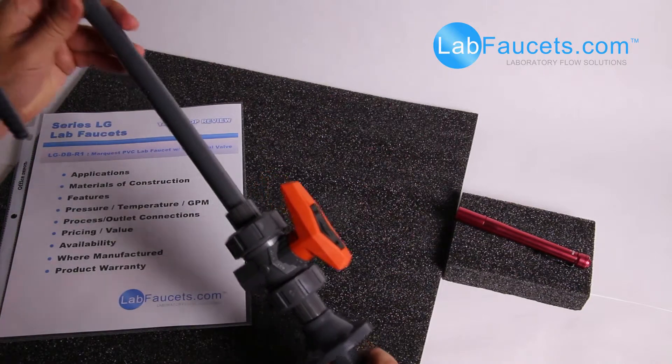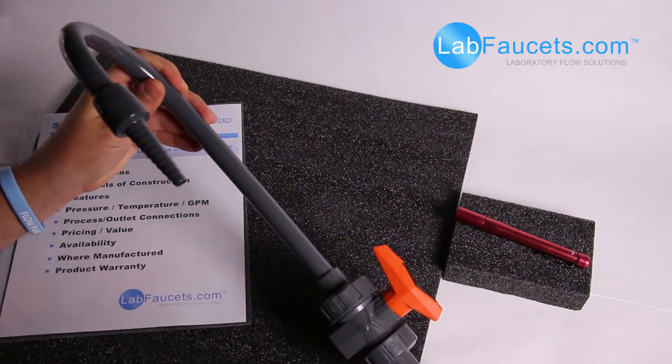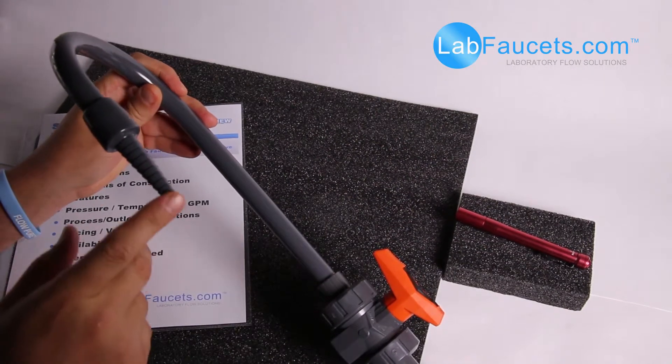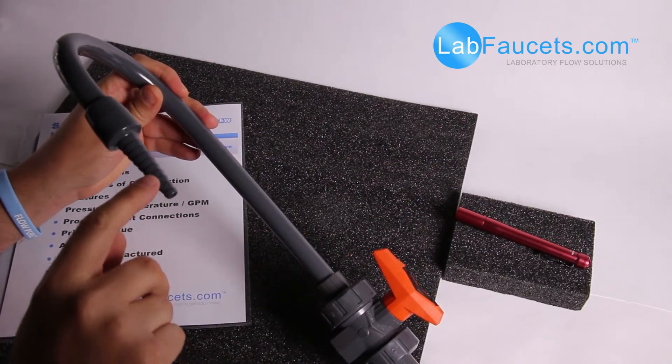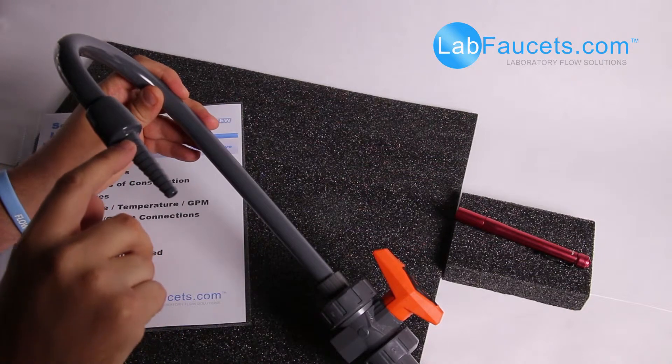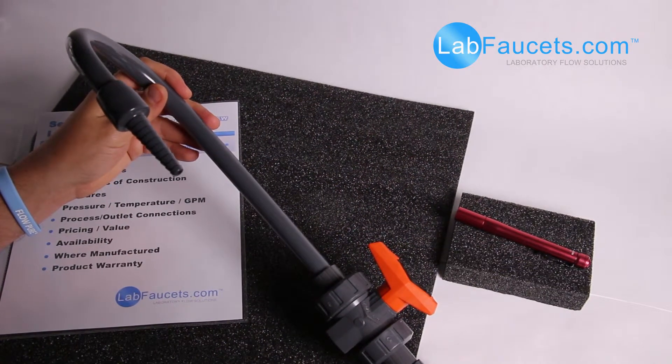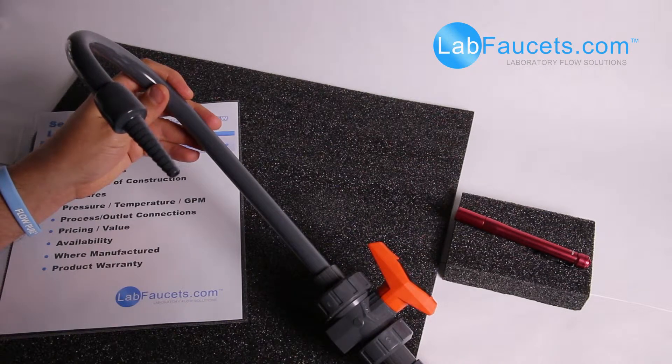The outlet connection on this unit is a serrated barb tip. For this faucet, there are nine to ten serrations, accepting quarter-inch ID to half-inch ID low durometer tubing.